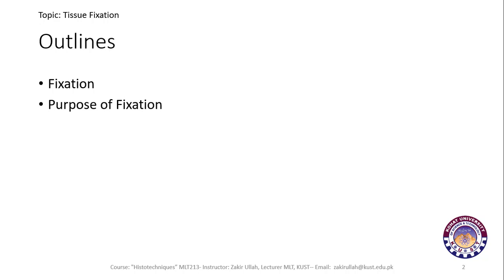The second outline of today's lecture is the purpose of fixation. What is the purpose of fixation, why fixation is important, and in the third, we will discuss the different changes that occur during fixation inside a tissue, what are the side effects, what are the bad effects or the good effects of fixation during fixing a tissue.